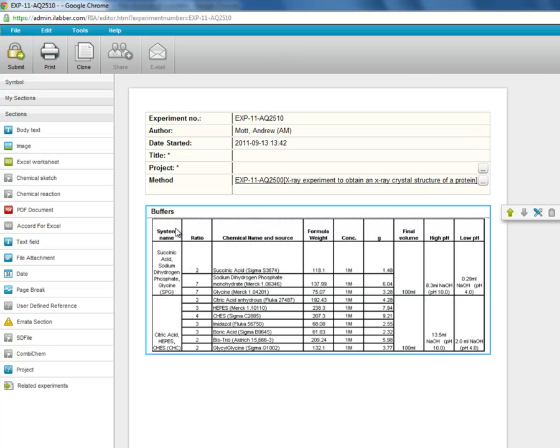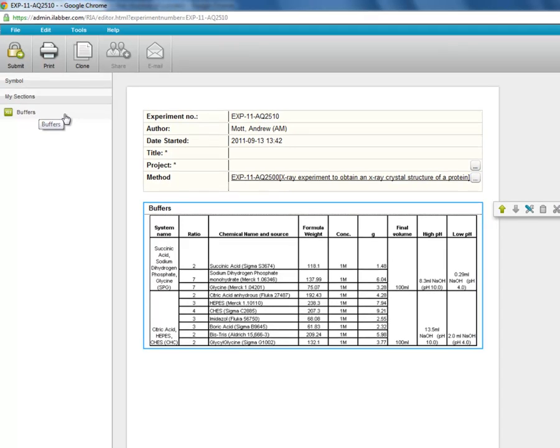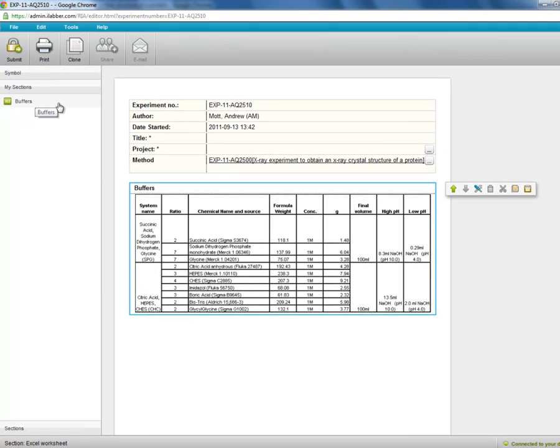Now if we go to the my sections toolbox on the left hand side, you will see that this section is here. This section can now be added to any experiment in exactly the same way as we add ordinary sections from the section toolbox.